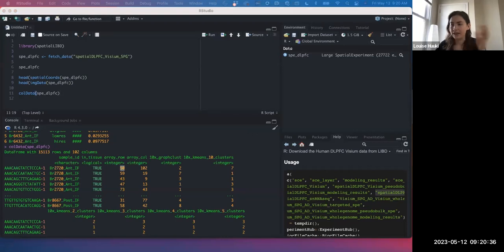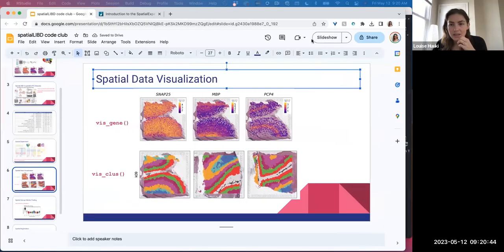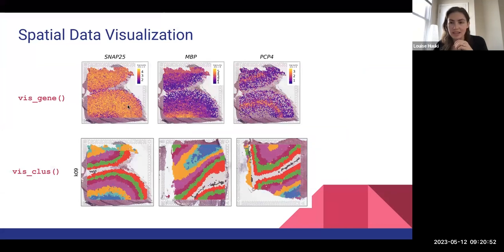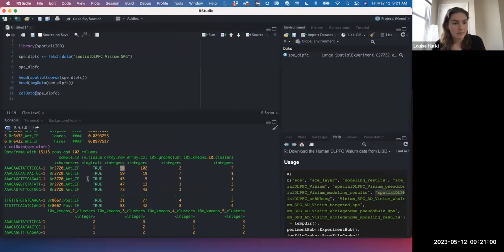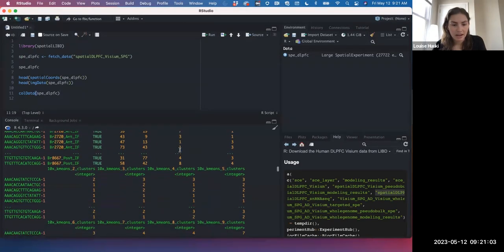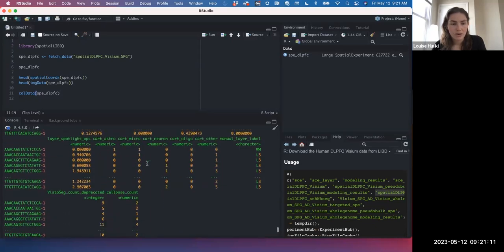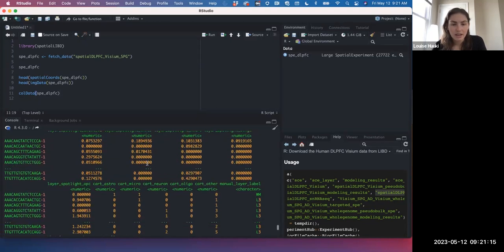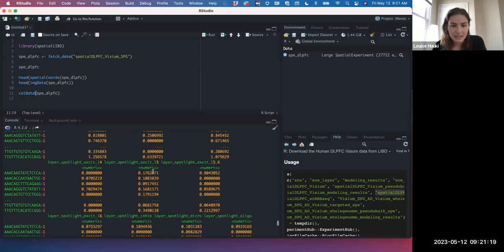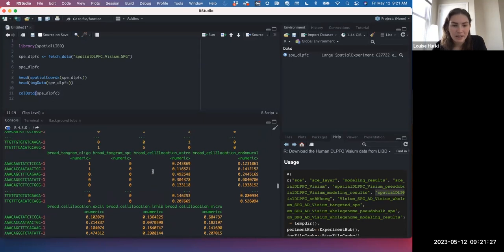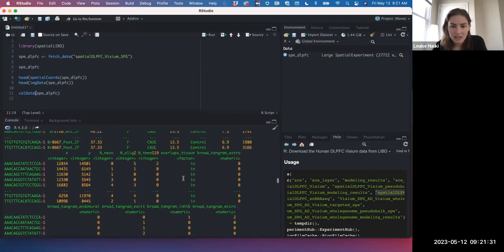A great way to explore this data and understand what's going on is by visualizing it. There are two main visualization tools: vis_gene, which helps visualize continuous variables over the spots, and vis_clus, which helps visualize discrete variables over the spots. Some notable colData columns include a 10x clustering, manually annotated histological layers and white matter, and also Nick's cell deconvolution results.